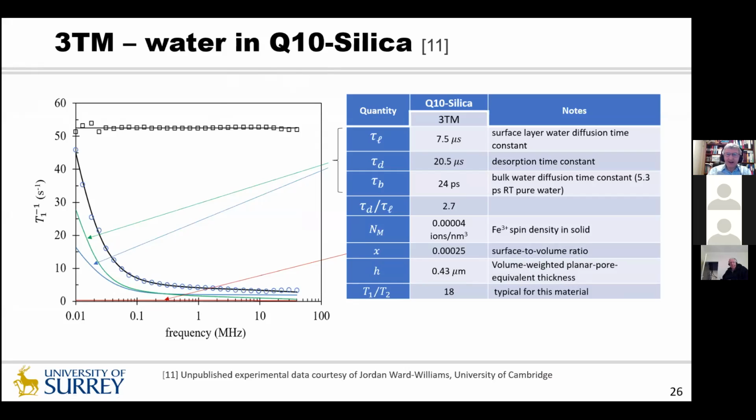We're seeing a whole set of good numbers again, and again we're throwing everything at this model here. So we have a weak concentration of paramagnetic ions, the water-water contribution, and a very, very small, virtually negligible ion spin density right down here. Two things to point out.